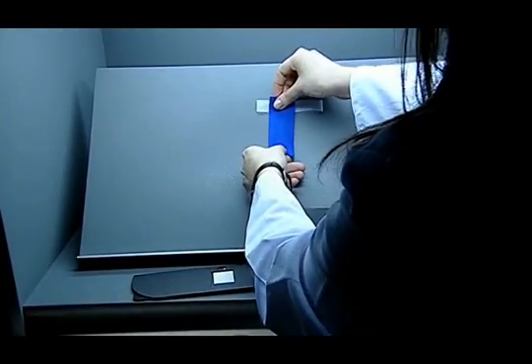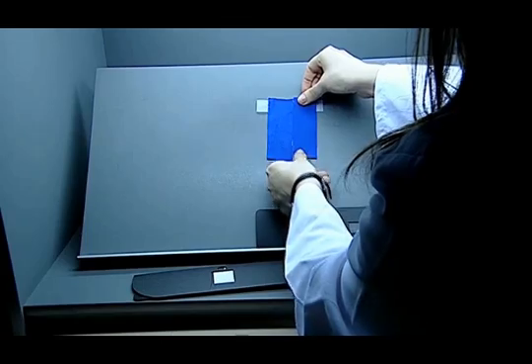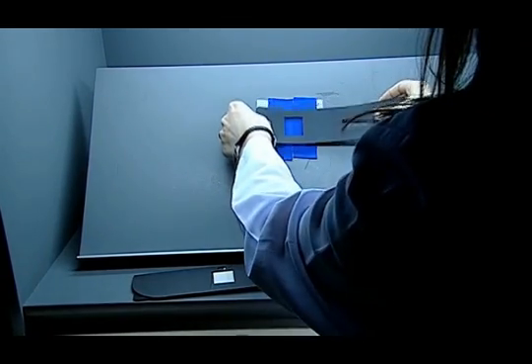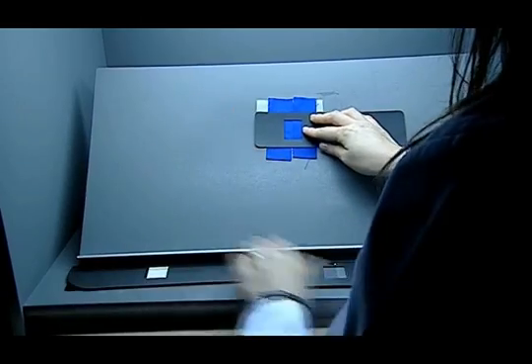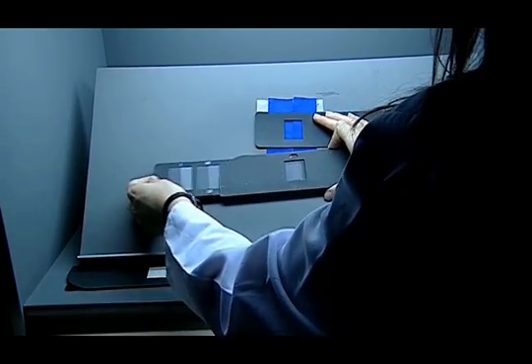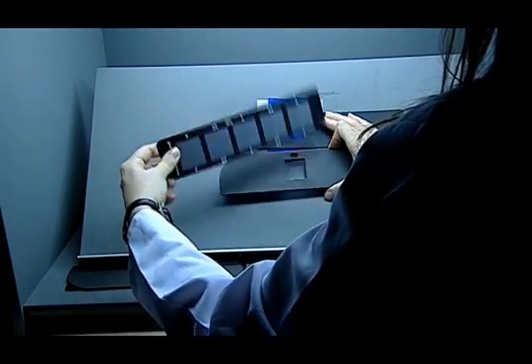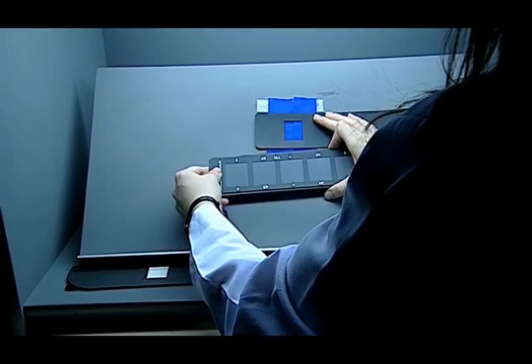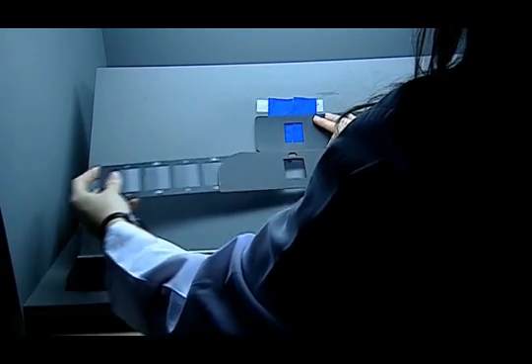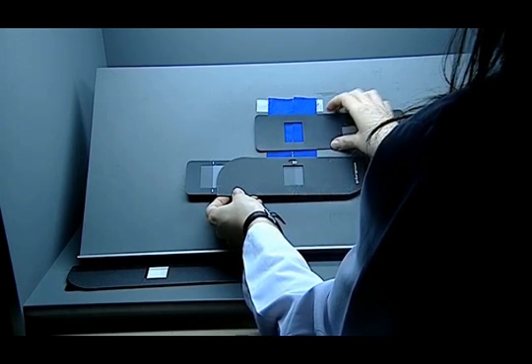The second step of determination is the fading of color. For this step, the original sample is placed on the left side and the tested sample is placed on the right side. The differences between these samples are determined with the help of a mask. The difference between them is determined with the discoloration scale. There are values on the scale from 1 to 5, enumerated as 1 being the worst and 5 being the best value. The test result is given by comparing the difference between the sample and the original with the scale.